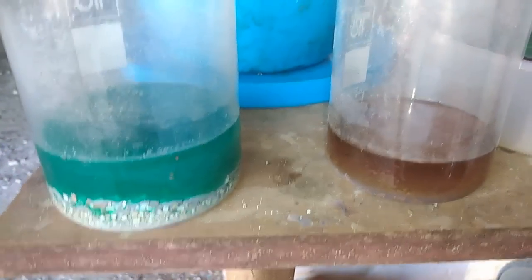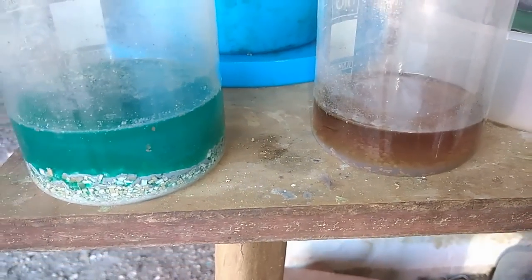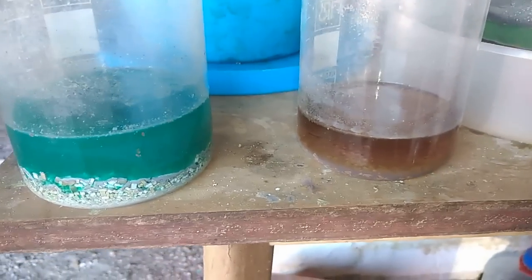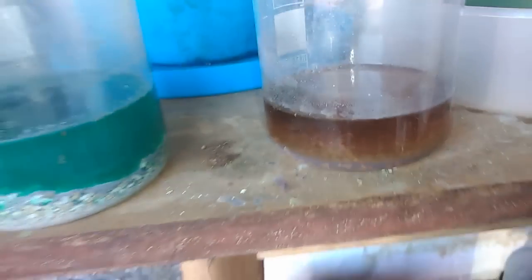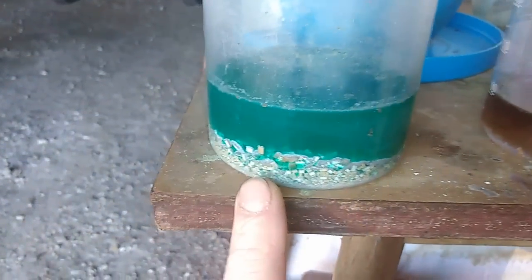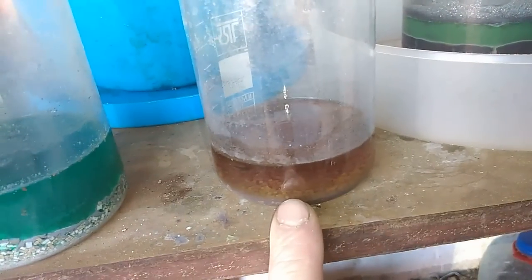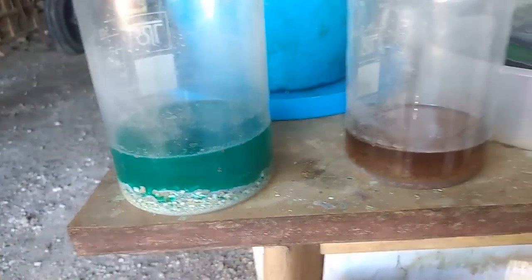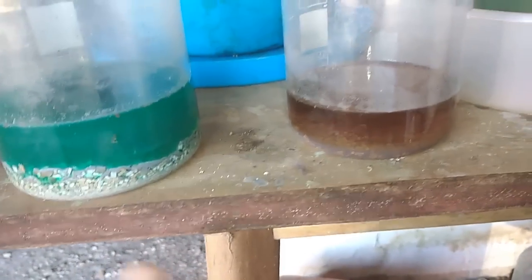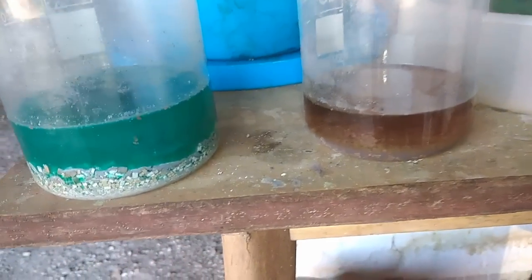After the reaction finished, I left that for a couple of days - three or four days, I don't remember exactly. This is our non-magnetic solution - you can see it settled down. And this is our magnetic solution. You can see the green color versus the gray color - that is the palladium-nickel difference. Right now I will filter both solutions and extract all the other material.